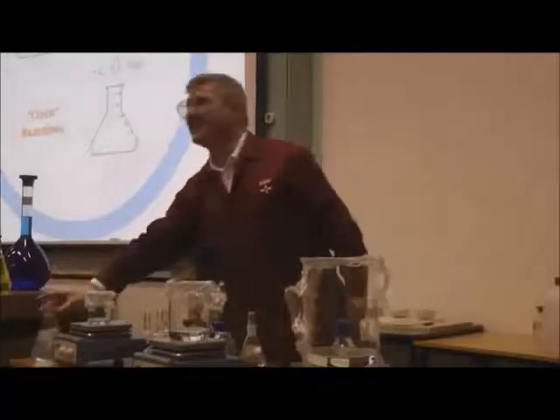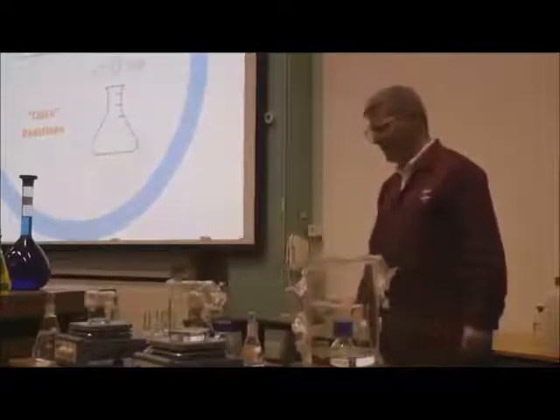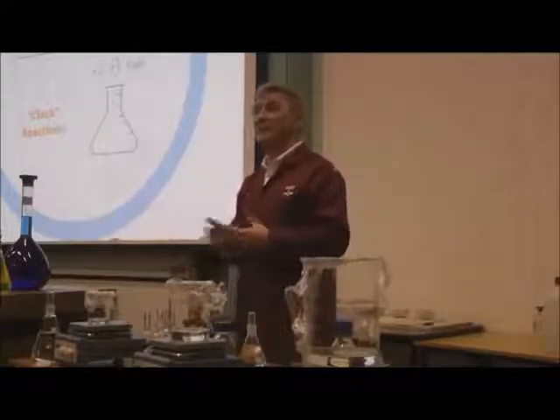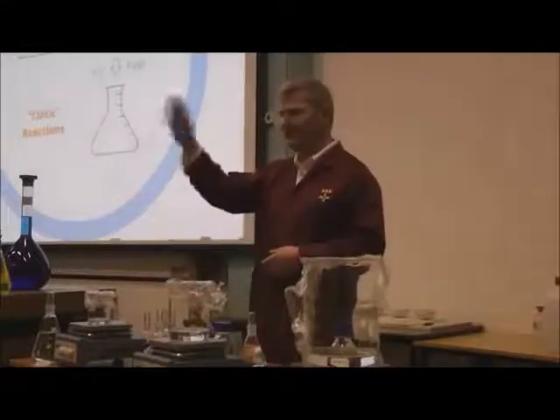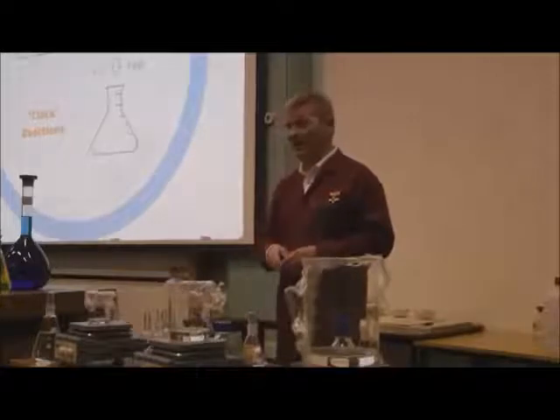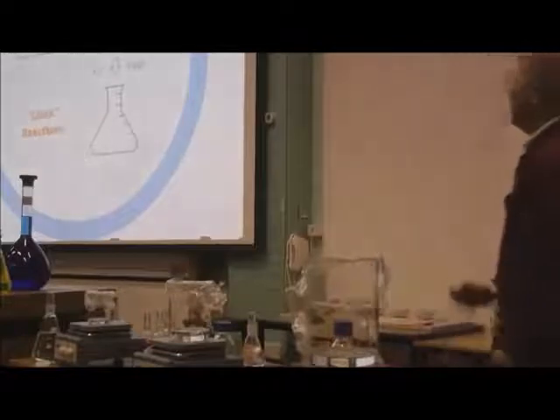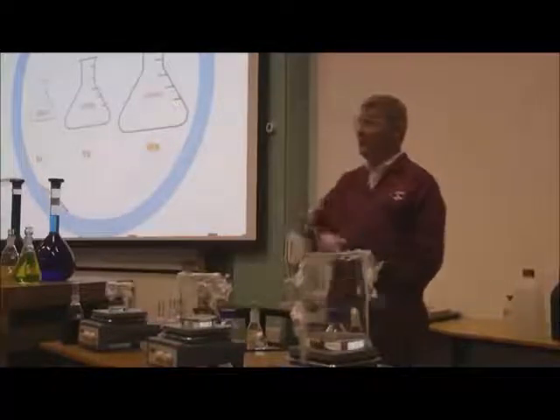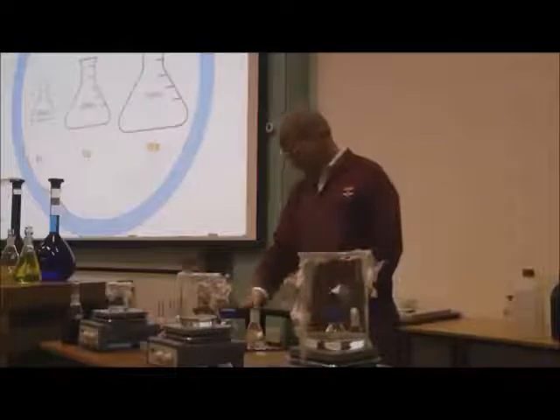I forgot how many seconds I made this run for. Might be 2 minutes, might be 10 minutes or something. But what's happening is A is going to B, and B is reacting with C, and it's remaining colourless. So keep your eye on that, and I want people just to tell me when it changes colour. Keep my fingers crossed that it will. Okay. And I quite like audience participation in these things. So, see? So A plus B plus C, where C reacts with B and removes the colour, we get this delay.